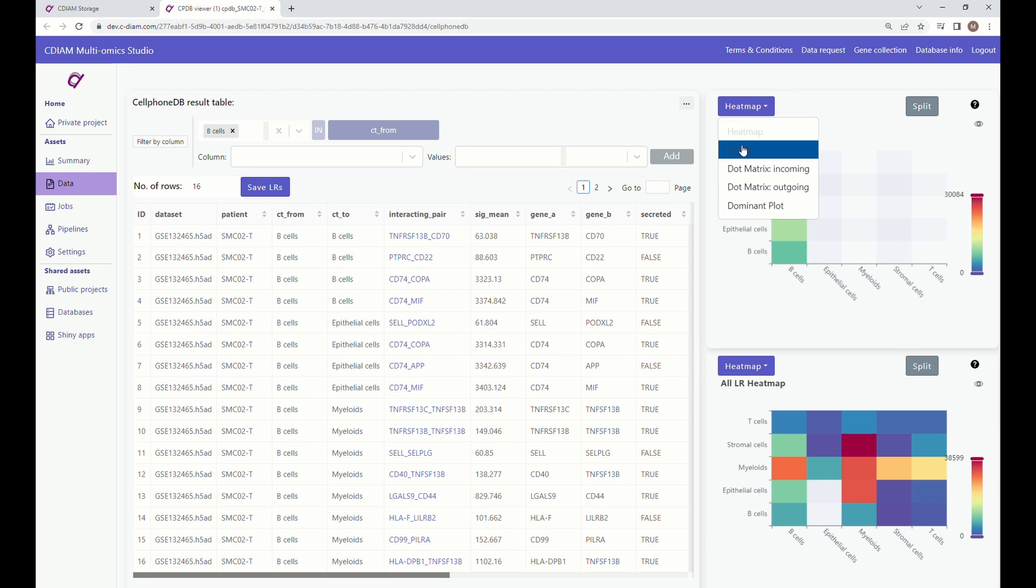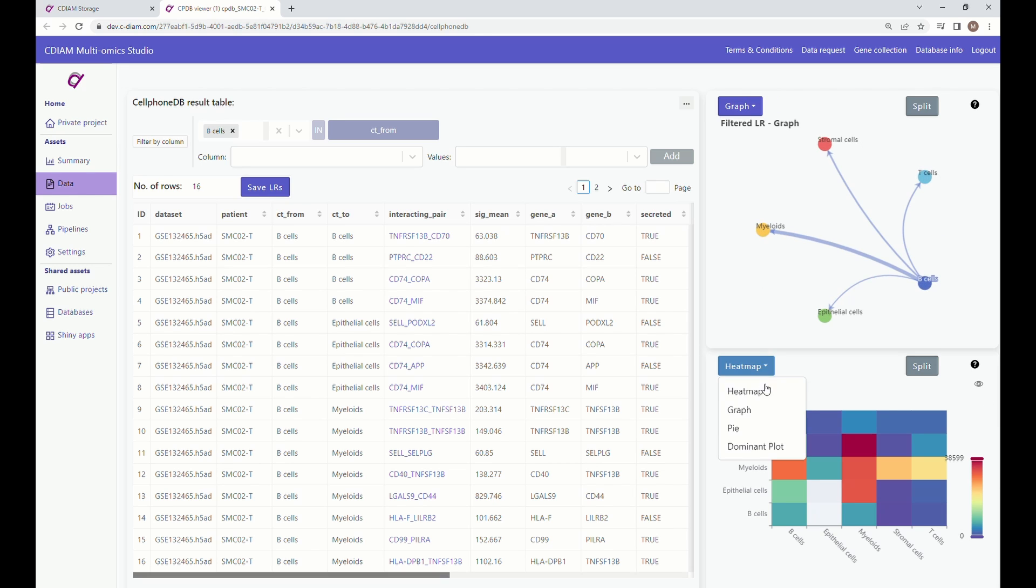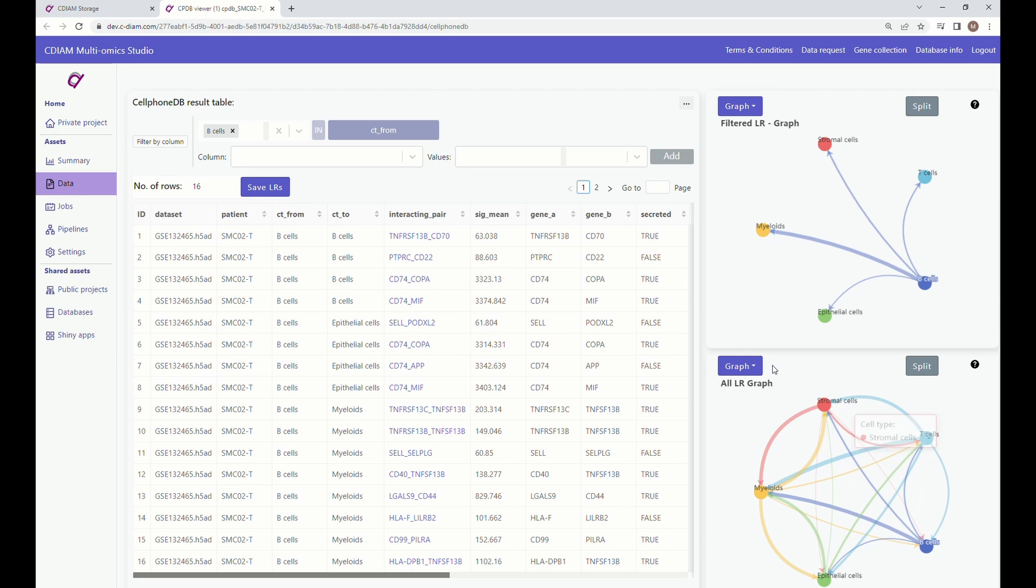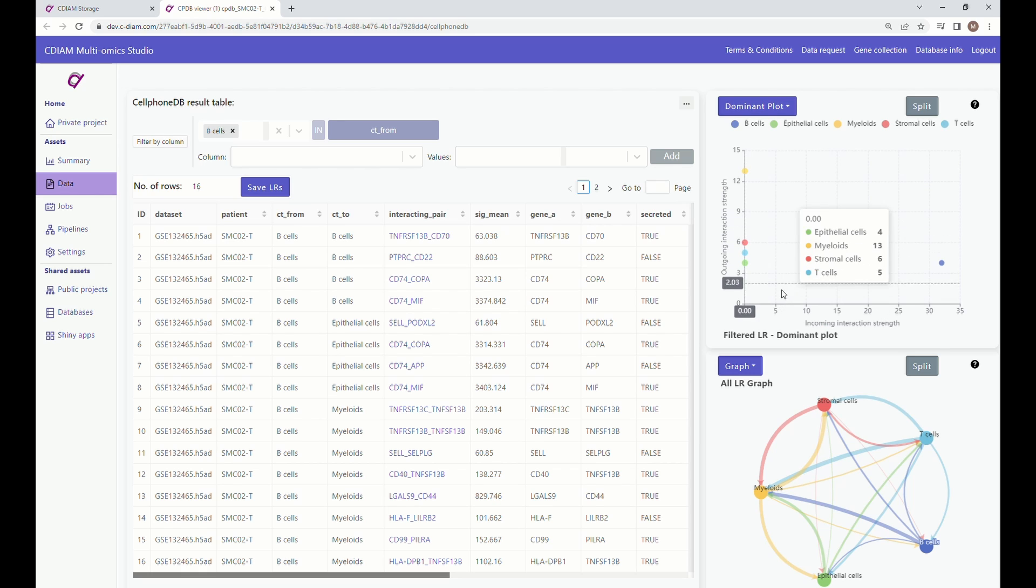You can also change to graph option for better visualization. In the dominant graph, you can see the number of outgoing and incoming interactions for each cell type.